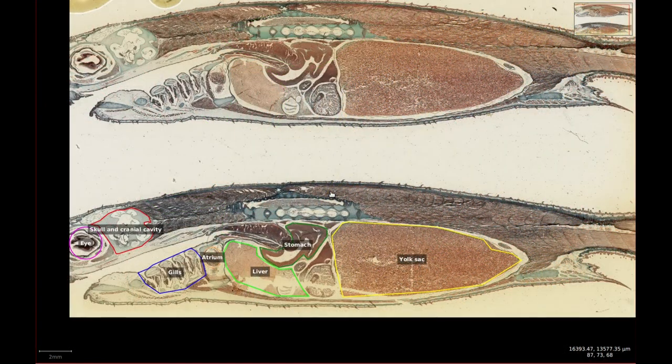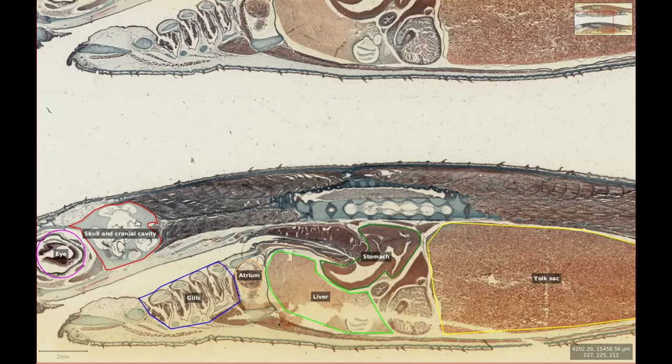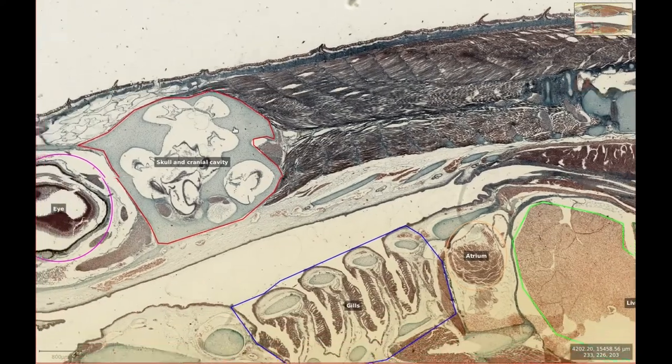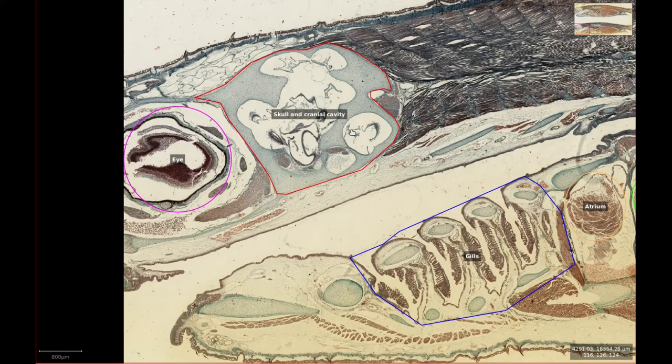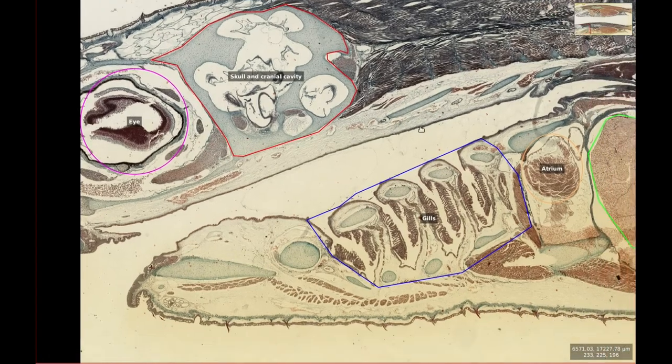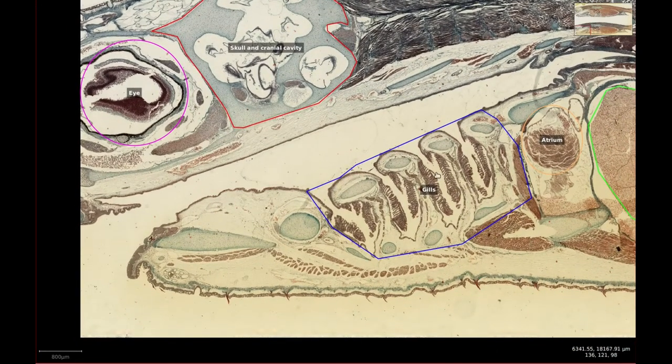Next on our journey from medial to lateral, we have slide 244. There's no brain on this section, but we finally have a slice through the eye, behind which we have some of the skull made up of cartilage enclosing some cavities. Ventral to that, and below the oral cavity, we have a larger section of gills where we can begin to make out the circular cartilage forming the five gill arches.